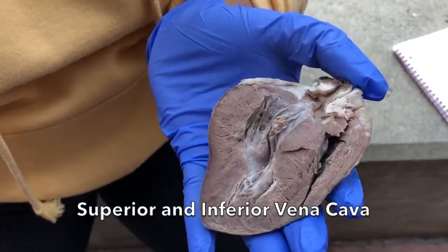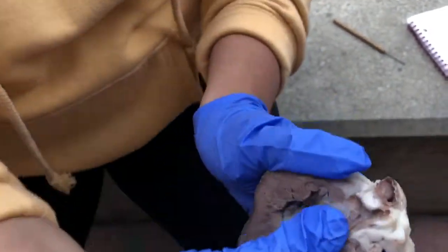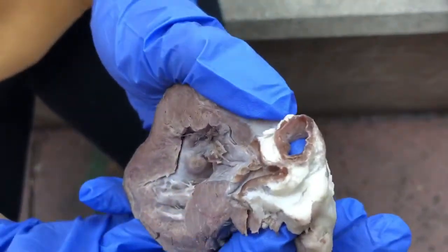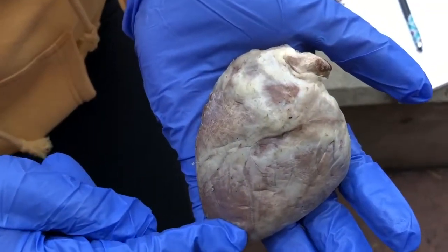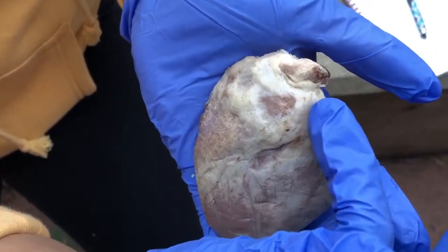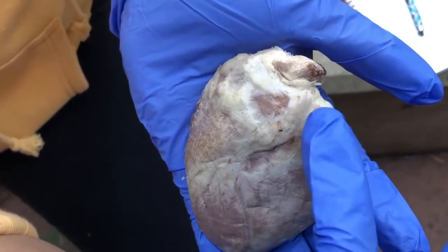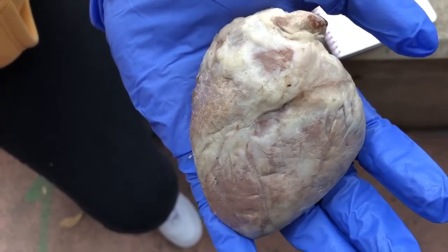Hi, this is Tatiana. So this is the right atrium right here, and if you go up, it leads to the superior vena cava. So we're on the anterior side of the heart now. This is the superior vena cava, and this is the inferior vena cava. It's not shown very well because it's covered by fat, but the inferior vena cava does bring oxygen-poor blood to the right atrium.